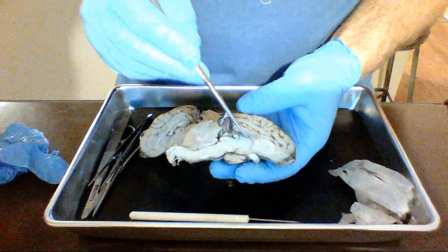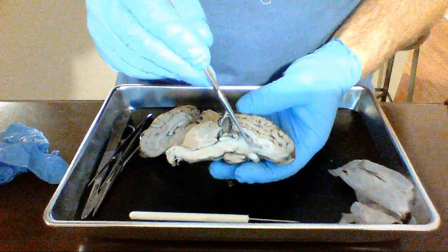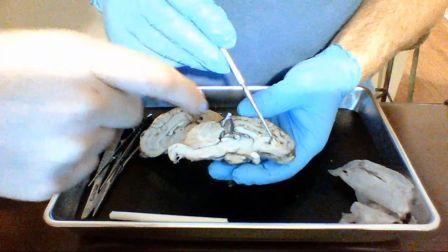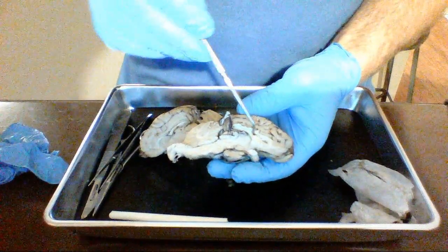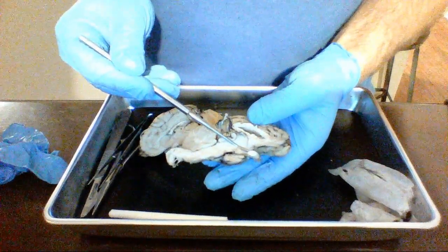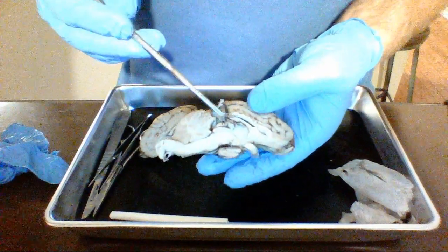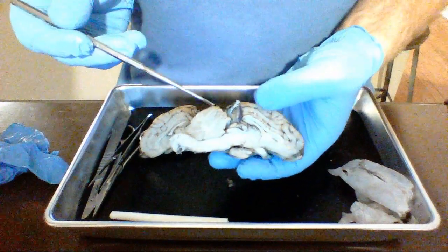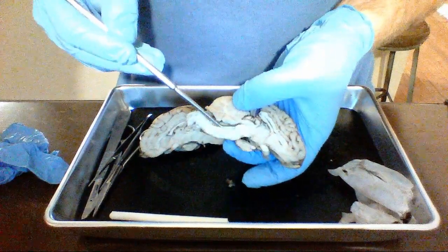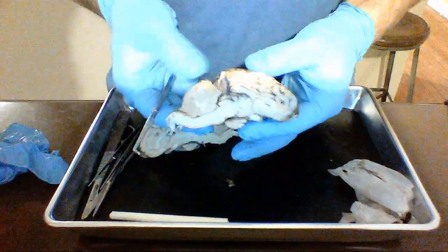That's called the septum. So if you poke through the septum, that septum divides two spaces. Pull it all the way. So that space is a ventricle filled with fluid. We've got your lateral ventricles. There's a beautiful view of that lateral ventricle. We've got three ventricles. The first two are the two lateral ventricles. Then you've got the third ventricle, and then the fourth. Okay. And that you'll have cerebrospinal fluid moving through there, and then around the meninges down around the spinal cord as well.